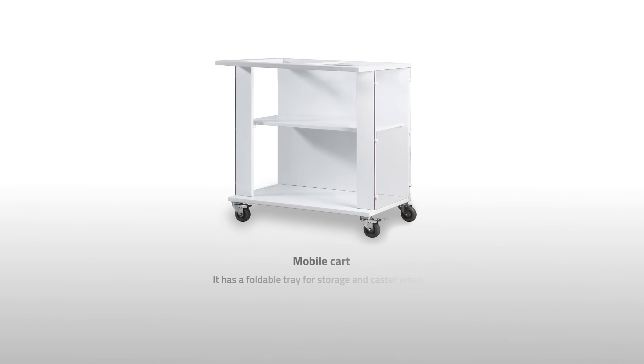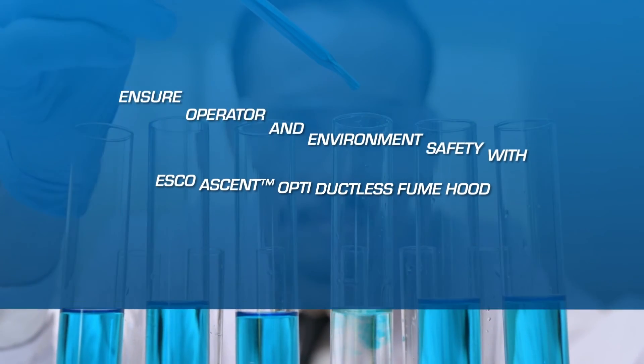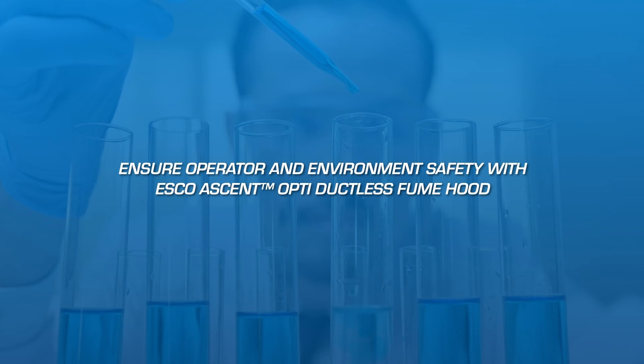An optional accessory is the mobile cart, which has a foldable tray for storage and caster wheels for easy relocation. Ensure operator and environment safety with the Esco Ascent Opti-Ductless Fume Hood.